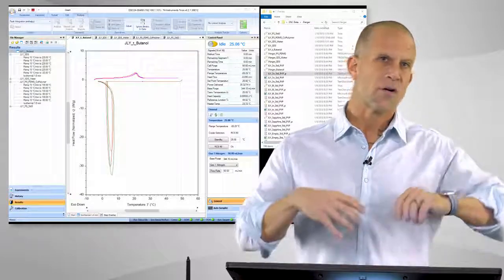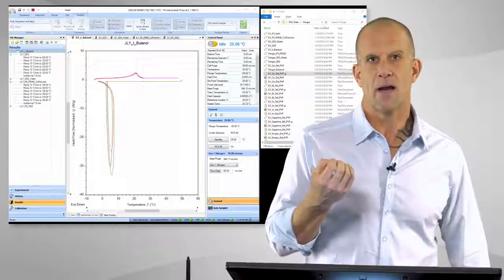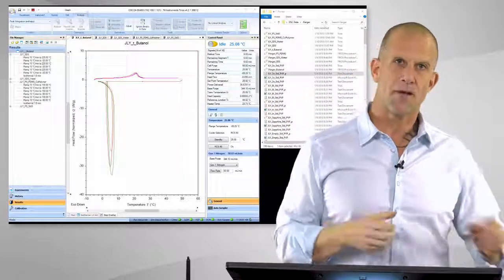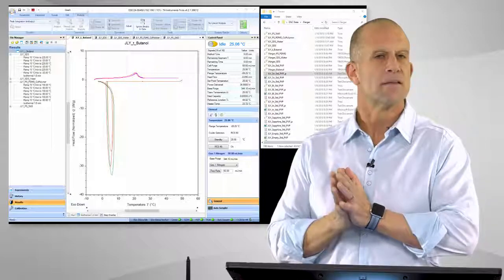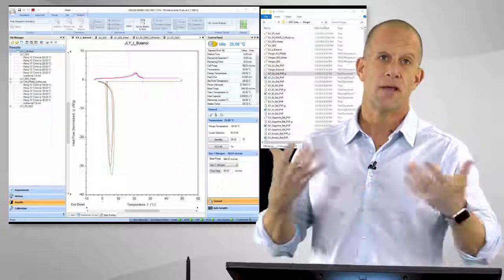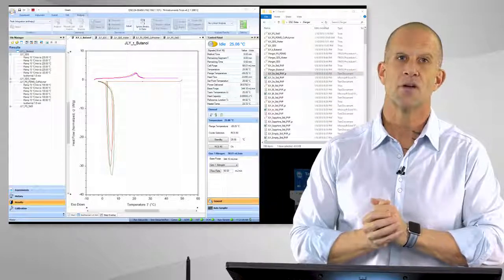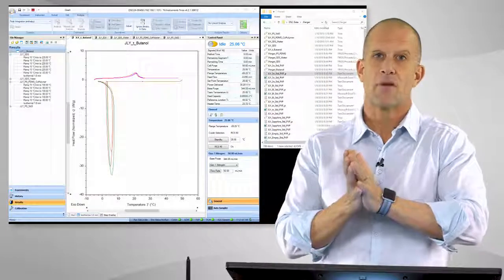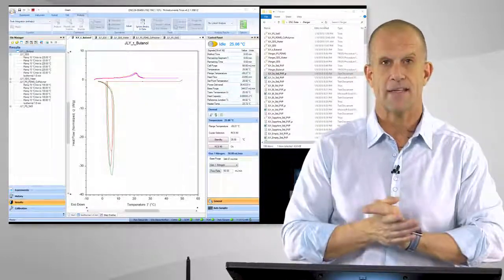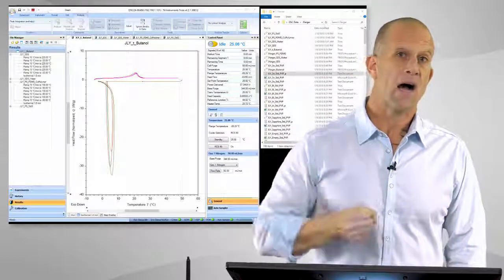However, in general, these are VNC, virtual network connection type programs, similar to Remote Desktop on PC, etc. So there are usually general ways to remotely view and or control a computer. This is a Windows system that interfaces to the calorimeter for setting it up, running it, changing the samples with the auto sampler, collecting the data, and this same program even analyzes the data. It's called Trios by TA Instruments.